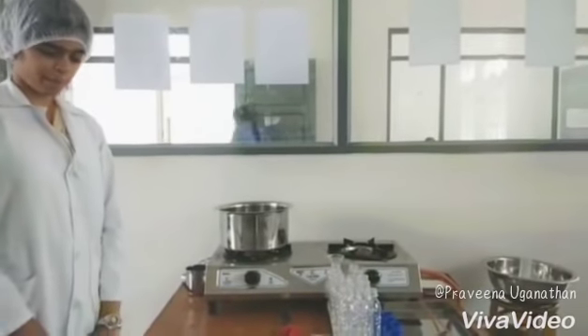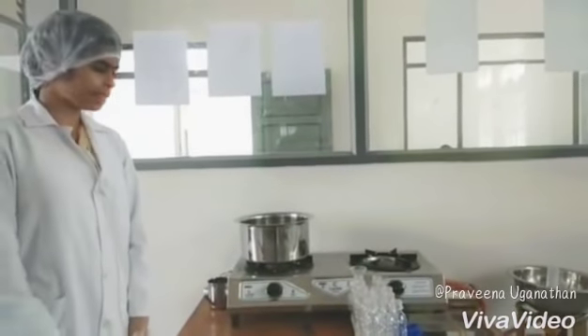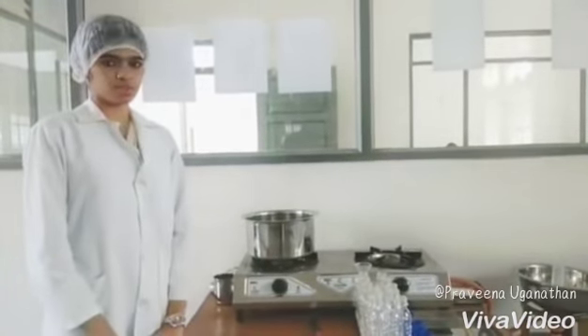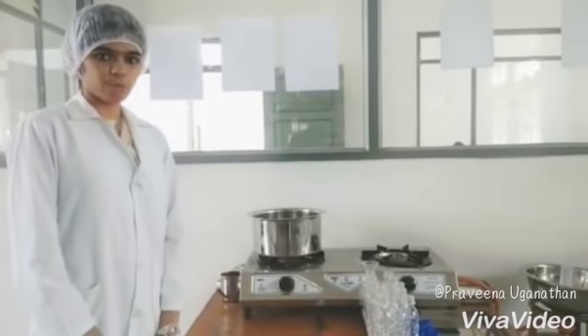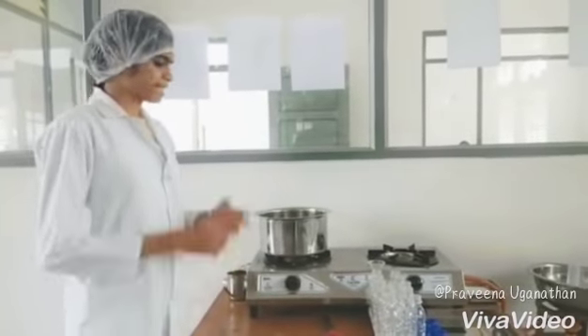Good day to all. We, the students of food technology, are preparing various types of carbonated beverages. I'm here to demonstrate the preparation of orange beverage, which includes five main steps: sterilization, preparation of sugar syrup, adding the ingredients and mixing with a magnetic stirrer, chilling, and filling and packaging.